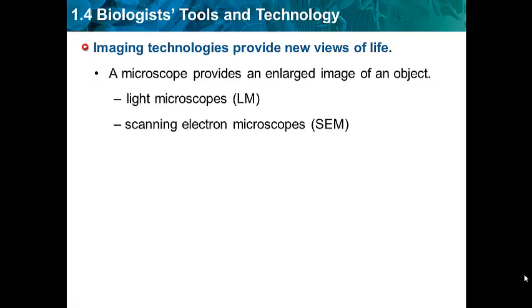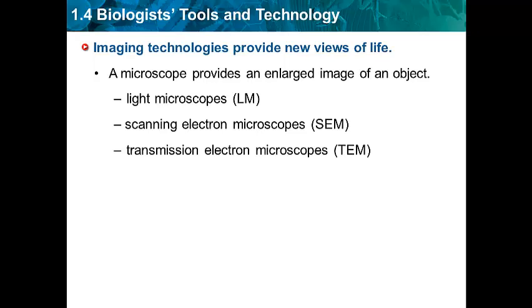Electron microscopes, developed in the 1950s, use beams of electrons instead of light to magnify objects. These microscopes can be used to see cells, but they produce much higher magnifications, so they can also show much smaller things. Electron microscopes can clearly magnify specimens more than 100,000 times their actual size. A transmission electron microscope transmits electrons through a thin slice specimen. The TEM makes a two-dimensional image similar to that of the light microscope, but the TEM has a much higher magnification.